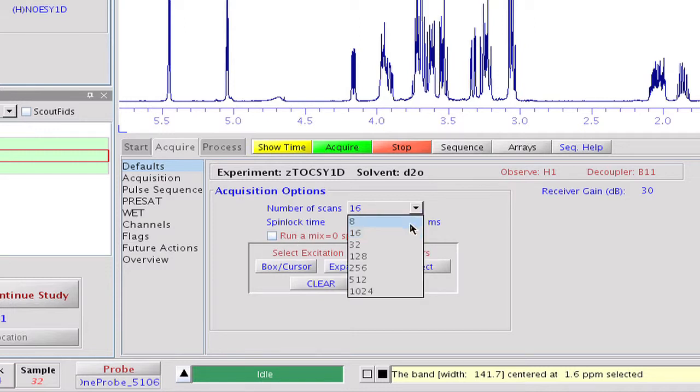Last, we define eight scans for each FID. We want to be quick, and select either a single mixing time or a mixing time array. A 150 millisecond long mixing period may allow the magnetization to be relayed over the entire spin systems.